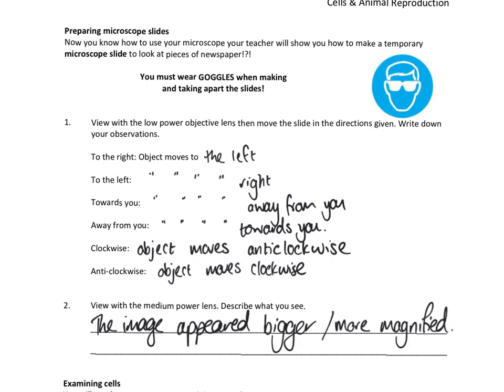So when we move from the low power lens to the medium power lens and then to the highest power lens, the image will appear bigger each time. The more powerful the lens that we use, the more magnified the image will become. And we can even see that by the magnification moving from, say, times 40 to times 100 to times 400 in total with the highest power lens.